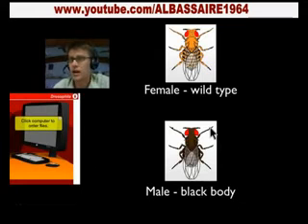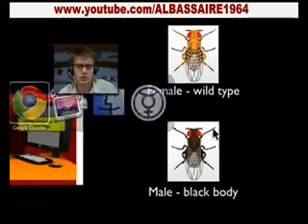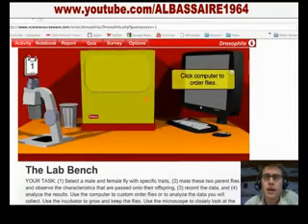What you do is you just knock them out. So you anesthetize them, and then they'll be knocked out. You can count them under a microscope, but we're going to do that all virtually. So let me jump into a browser for a second. And so you can log in as a guest, or you can set up a whole class, but let's log in as just a guest.